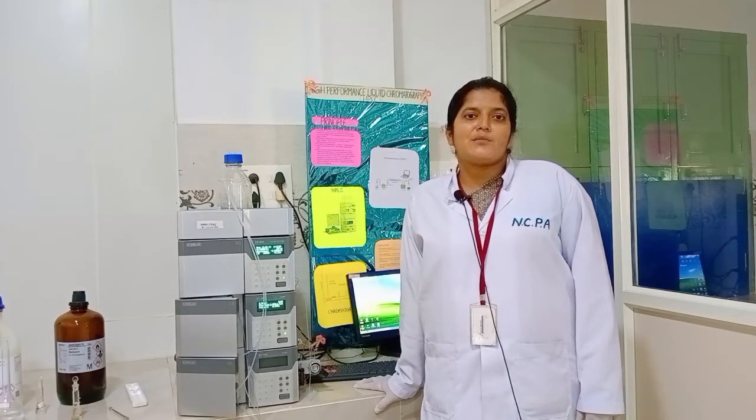HPLC is high performance liquid chromatography, or high pressure liquid chromatography. Here we use high pressure in order to resolve the components. Coming to the objectives of the HPLC, it is used to analyze the mixture of the components, to perform the stability studies, and to analyze the components present in the urine or the blood samples of the drugs of abuse.